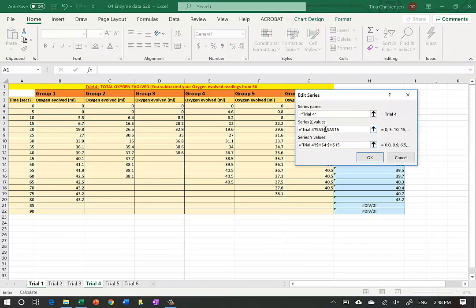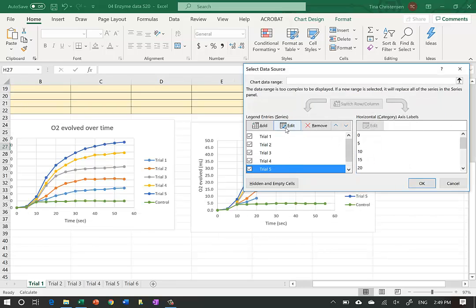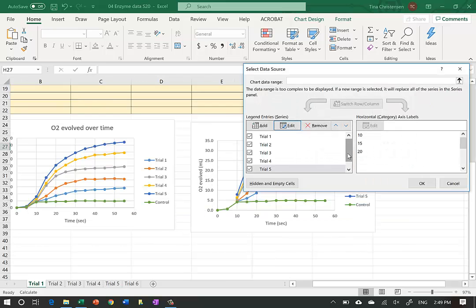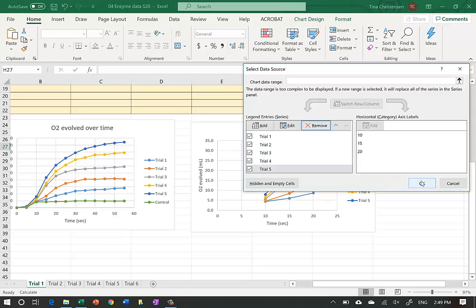We keep doing this for Trial 4 and Trial 5 - setting rows 6 and 8 for both X and Y values. For the control, I'm going to remove it altogether from this graph because we already used it to verify the air bubble issue - there's no reaction in the control, so it's not needed here. Then hit OK.